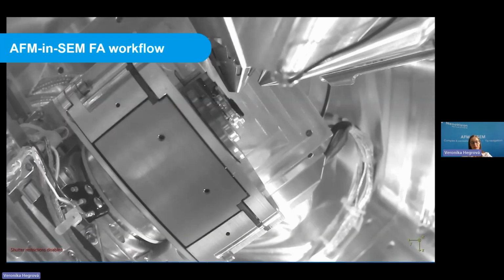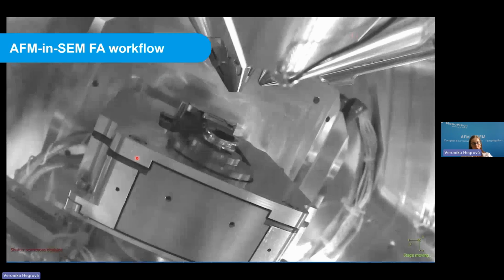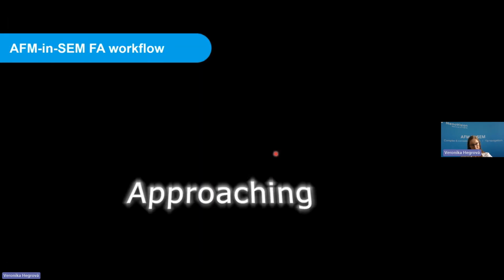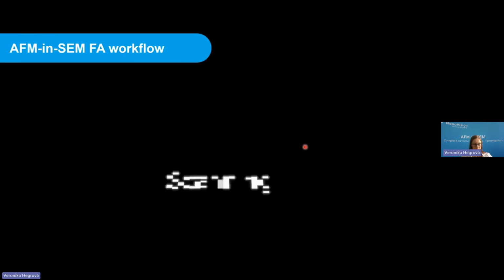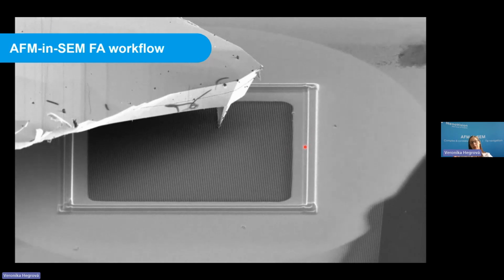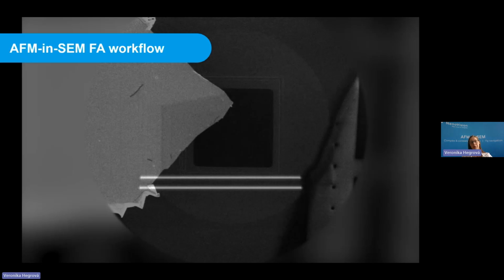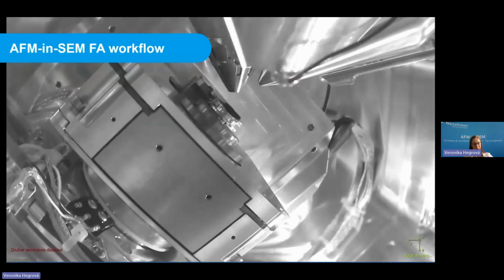So our solution workflow for the failure analysis is from the FIB milling. We can tilt back and forth as we wish. Then the probe is going from the docking position to above the sample surface, navigating and approaching the sample surface. Then we scan the sample. We can observe it simultaneously with SEM, and then we exit with the probe. This we can repeat over and over again.